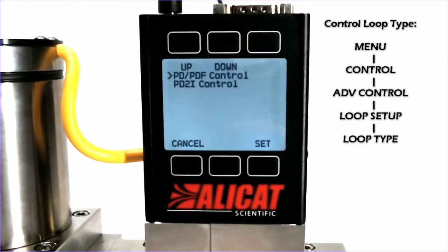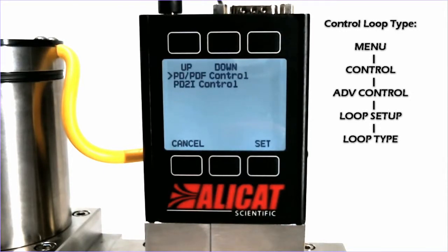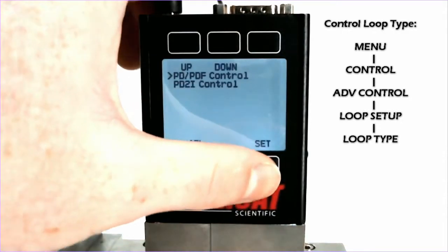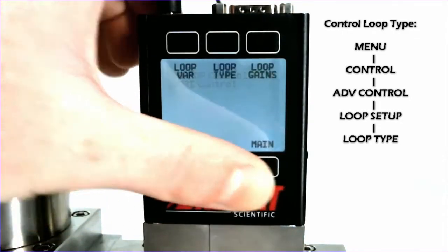PDPDF control is typically used for single valve controllers, while PDSquaredI Control is used for dual valve controllers and very fine tuning. We will select PDPDF for now.